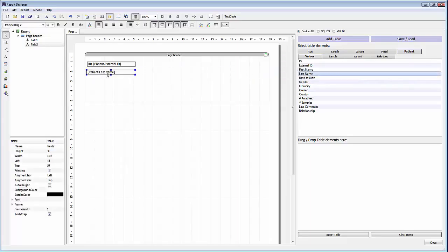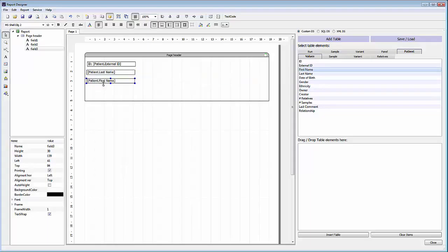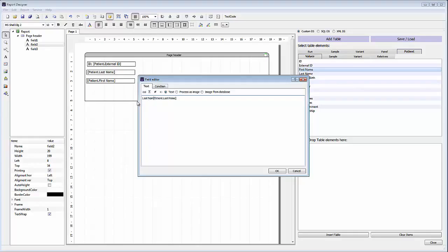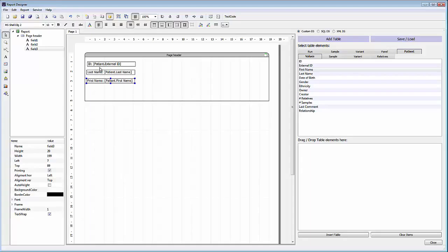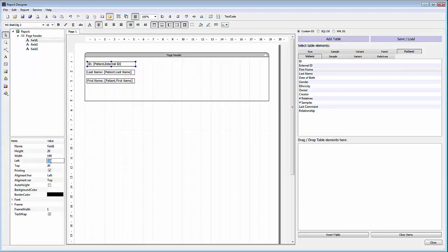In the same way we can also add fields for the patient's last name and first name. We can go into any of these fields and edit them in the same way. For any field added to the report template, you can see the characteristics for that field at the lower left side. One thing we can do to edit these fields after they've been added is make sure they're all lined up the same distance from the left side of the page. If we look at this left field, we have a value of 7. We can go into the other fields and change them so that they're all the same, so now all of these fields will be appropriately lined up on the left side.